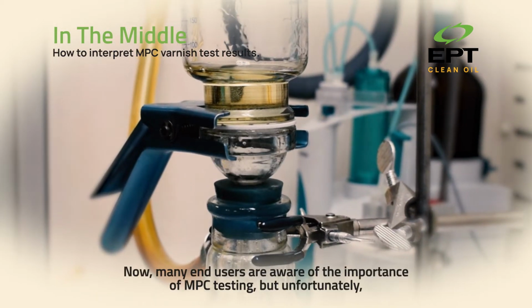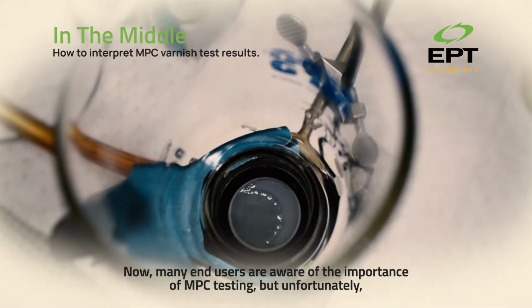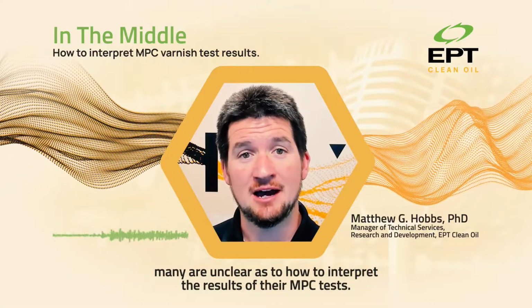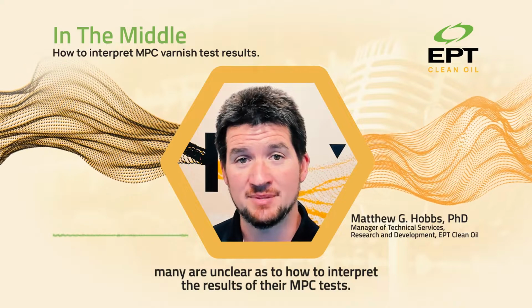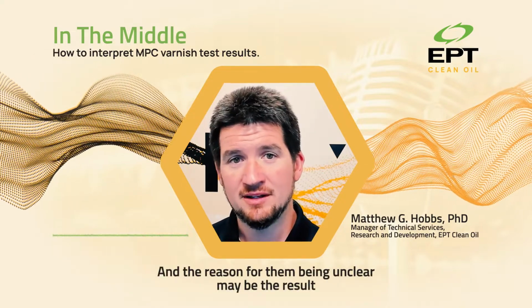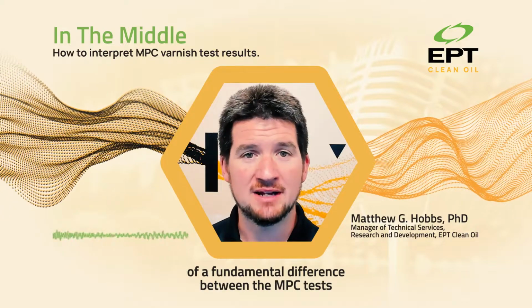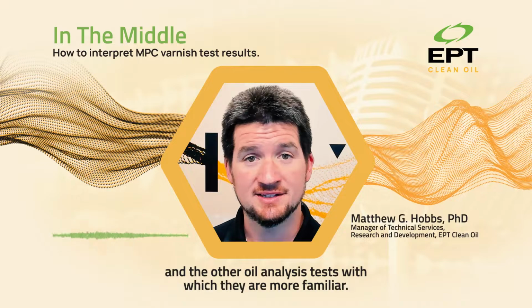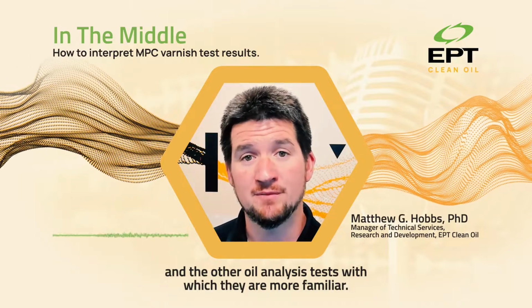Now, many end users are aware of the importance of MPC testing, but unfortunately, many are unclear as to how to interpret the results of their MPC tests. The reason may be a fundamental difference between the MPC test and the other oil analysis tests with which they are more familiar.